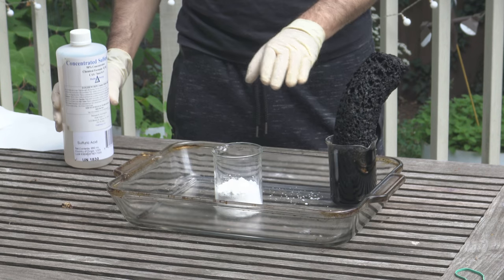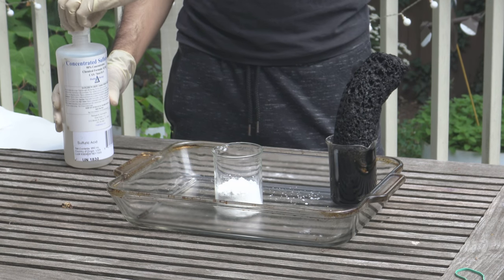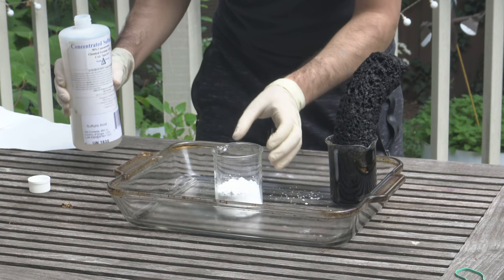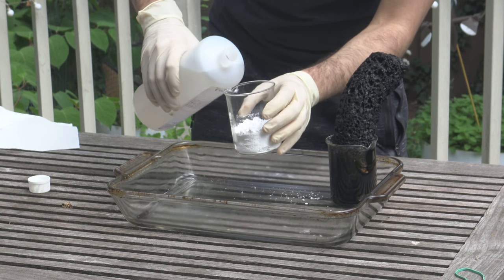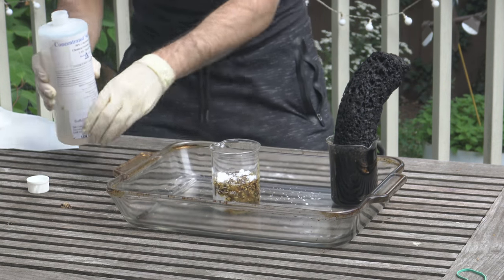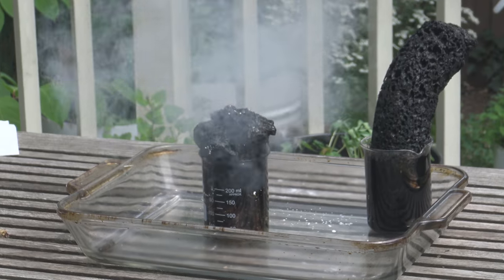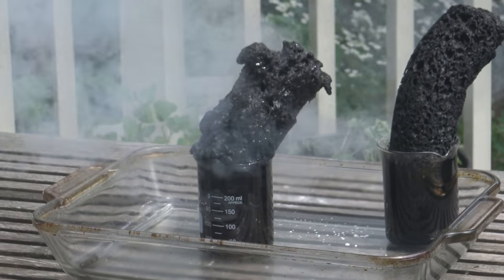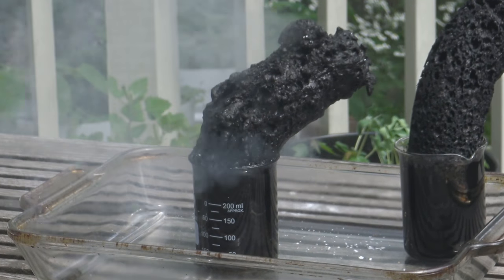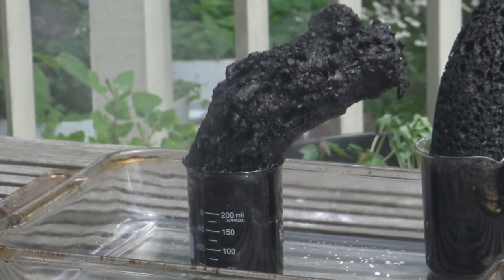Now having done this one, let's see what the powdered sugar is going to do. Oh, that reaction is quicker. That's a lot more aggressive. It didn't even give it time — it just went straight off.